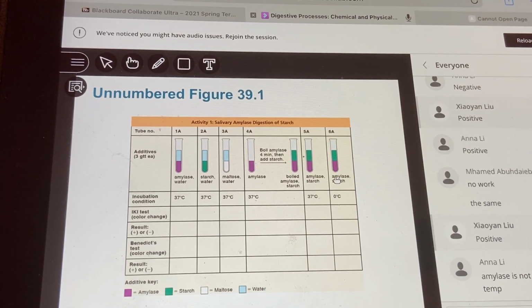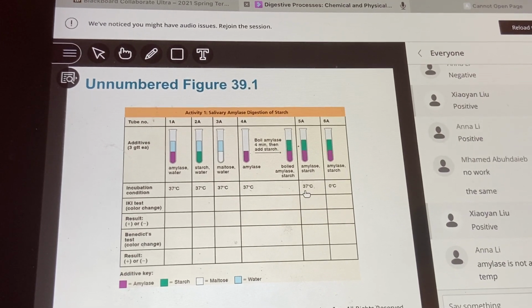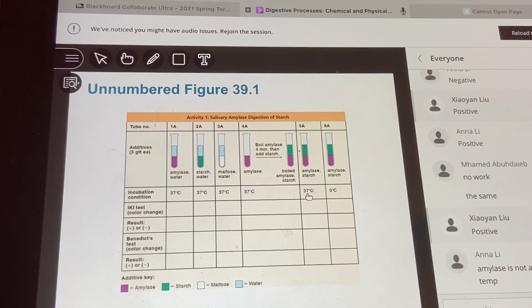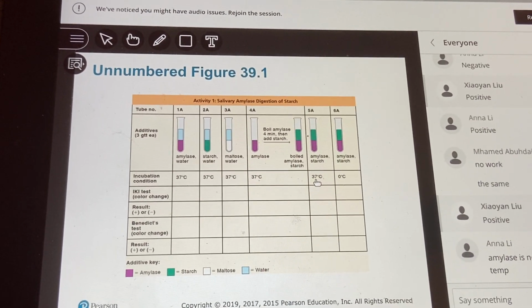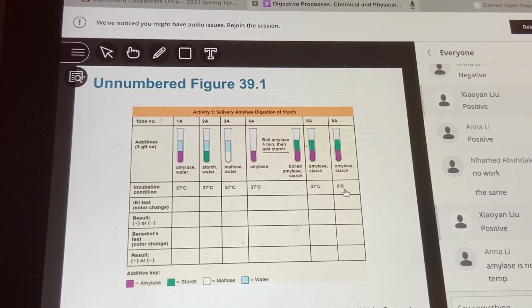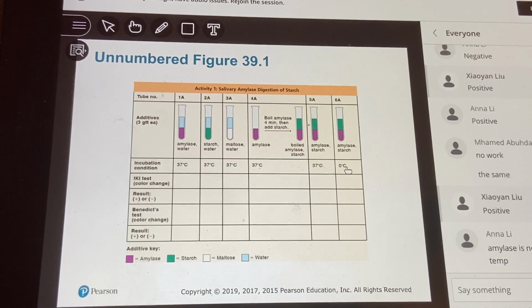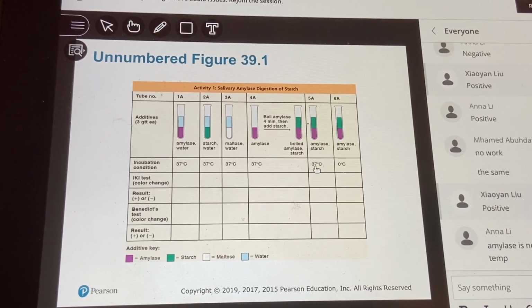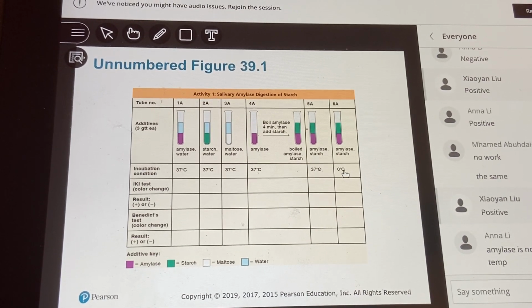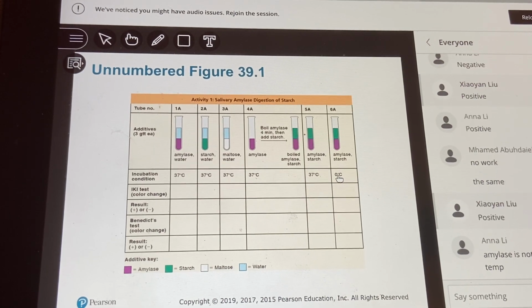Correct, because you are also killing the amylase. We said amylase works at its optimum, meaning it works well at 37 degrees Celsius. So now you soak it for 1 hour at 0 degrees, you froze it. It will not be working well because it likes the 37 degrees Celsius temperature. You may not kill it, but basically you are denaturing it also.